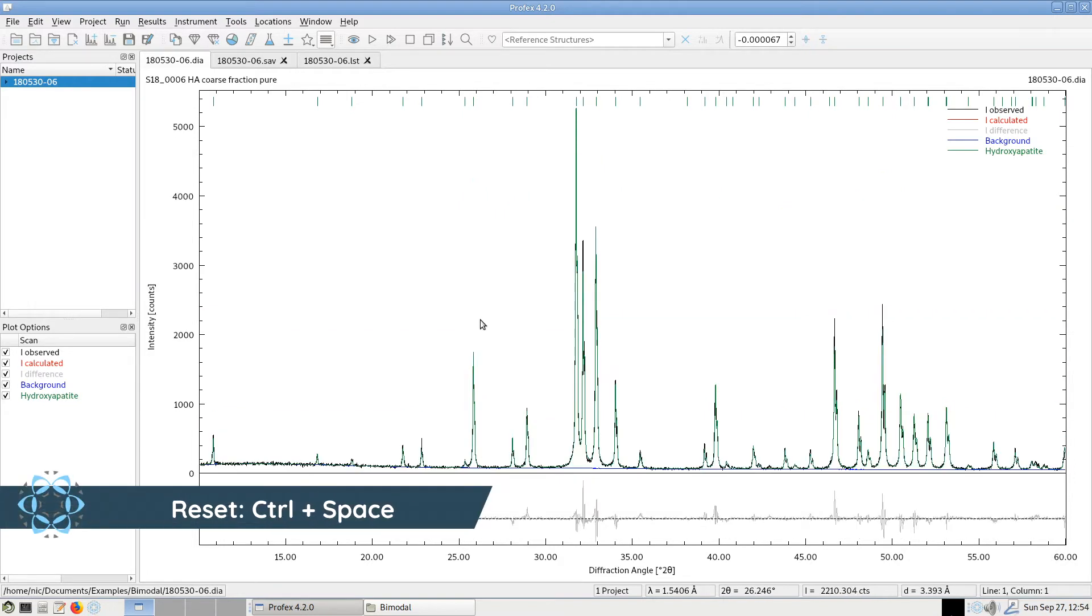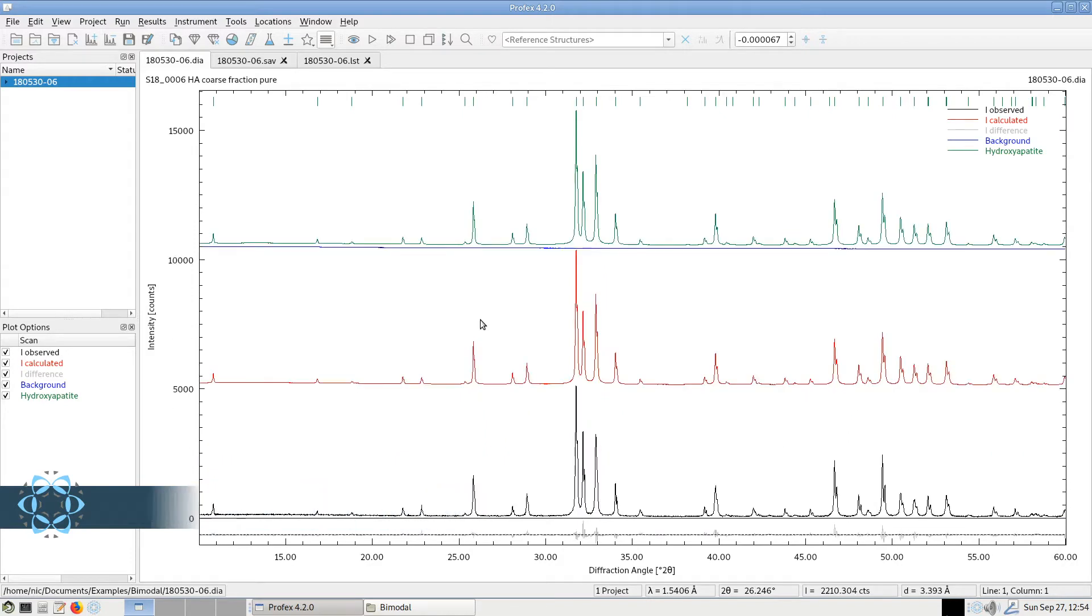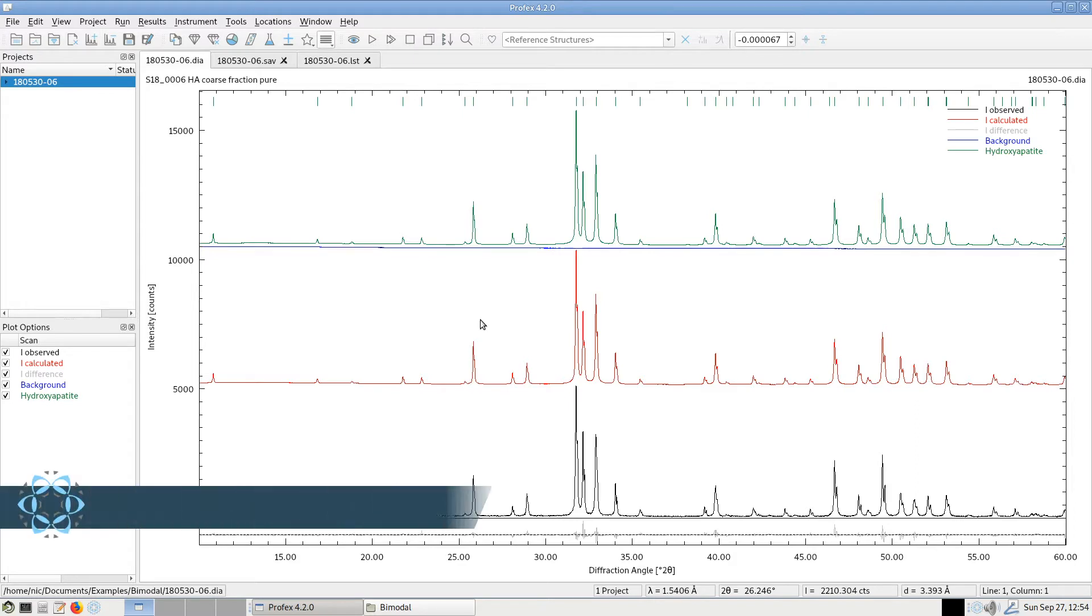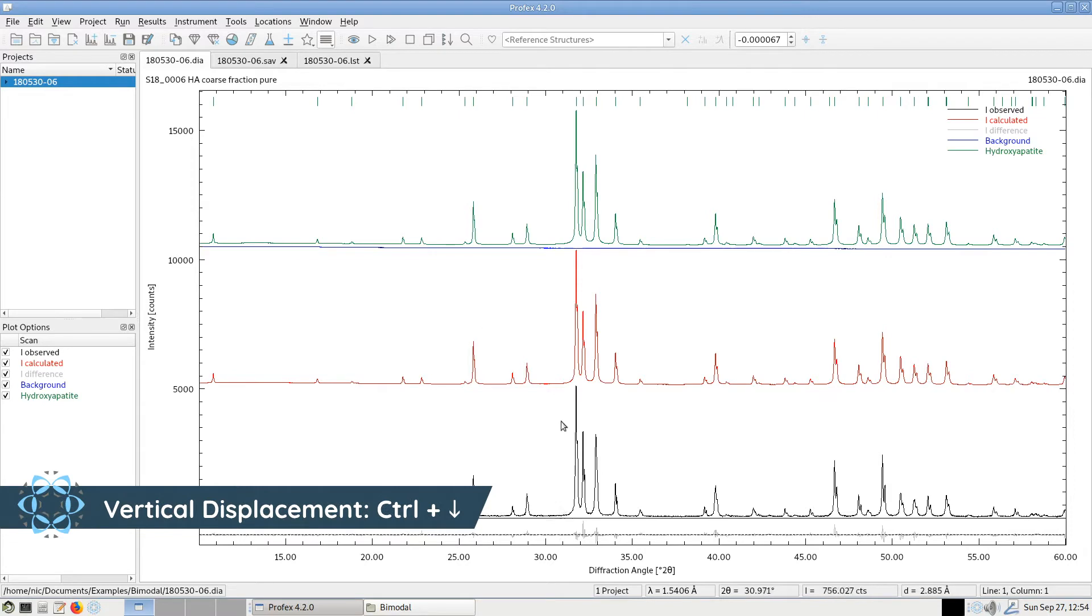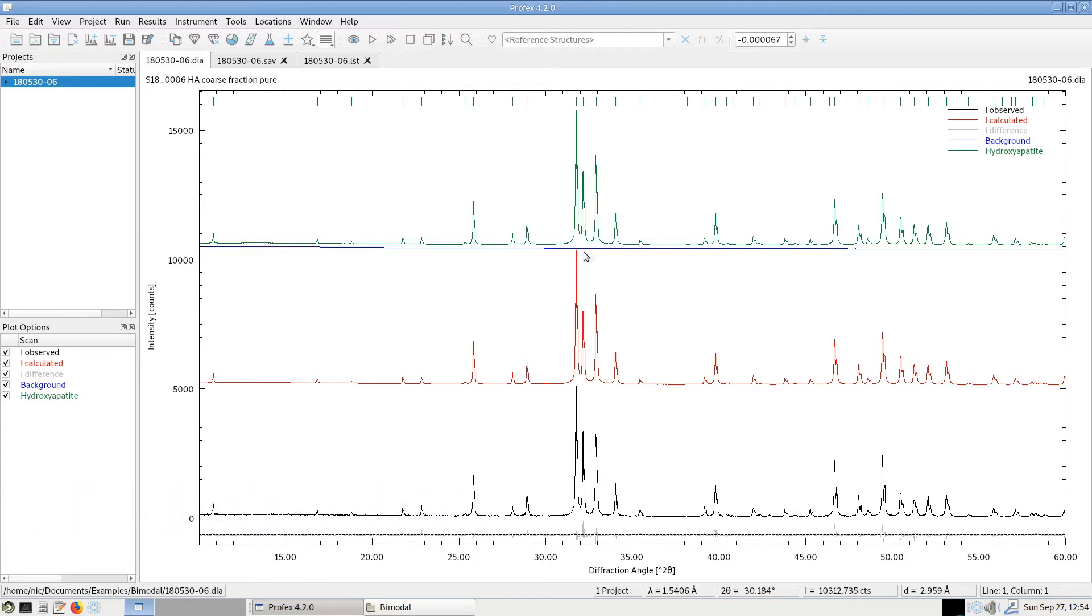If we hold the Ctrl key and press the arrow down key, we also get a vertical displacement. But this time it's not using the same offset for all scans. But it's only displacing them as much as necessary. So for example, let's have a look at the background curve. Now we get a very small displacement towards the next, the green scan.